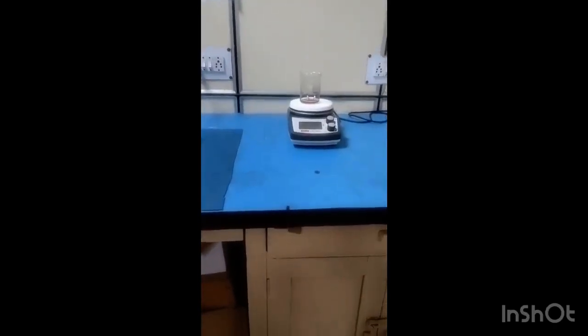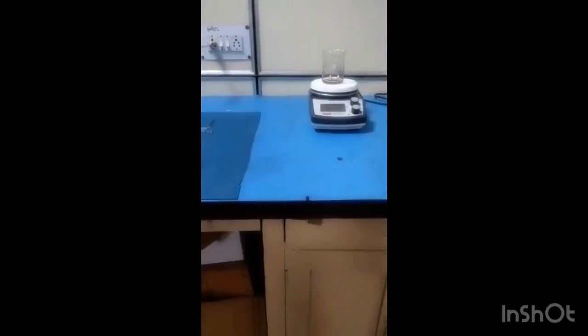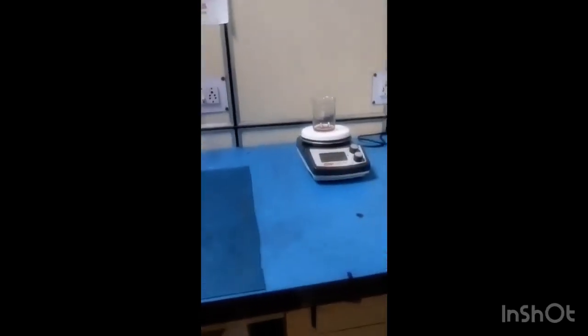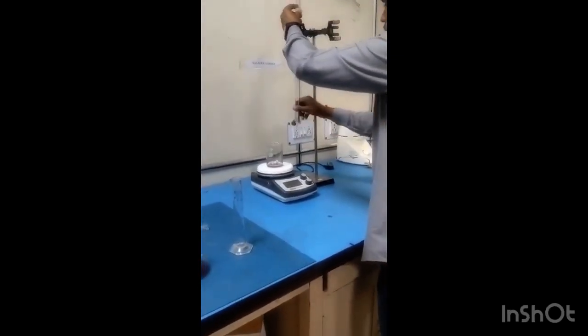Then take 10 ml extract of the maintained pH solution and place it on a magnetic stirrer for 30 minutes at 60 degrees Celsius and 640 RPM. Then simultaneously, drop by drop, 40 ml KCl solution should be added with stirring.